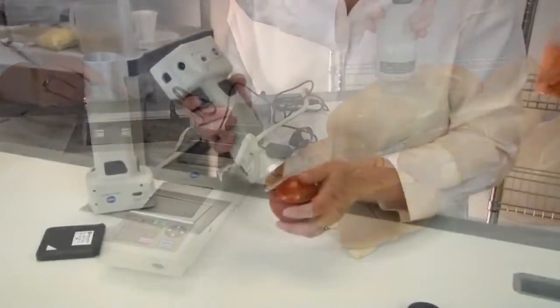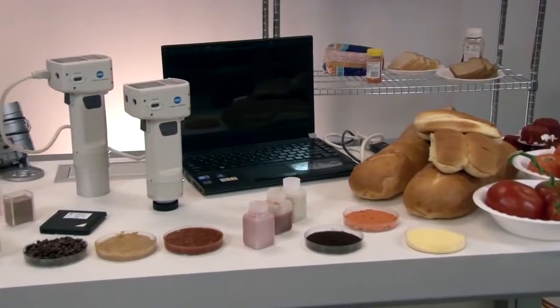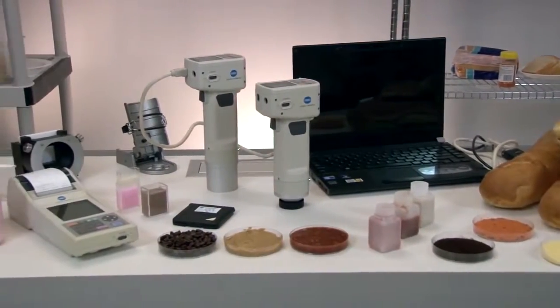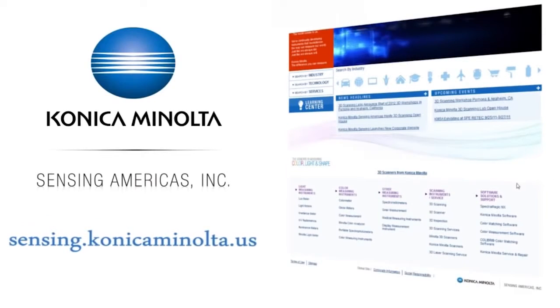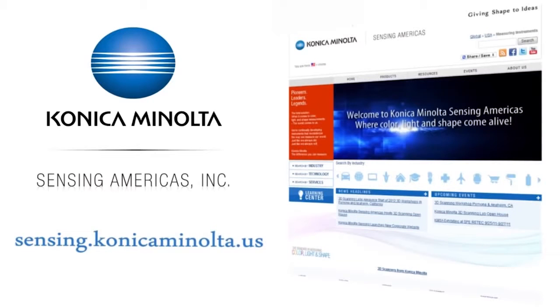Inspect, sort, select, classify, or grade the color of your product anywhere with Konica Minolta's CR400 and CR410 colorimeters. For more information on Konica Minolta Sensing's full line of color measurement solutions, or to schedule a free demonstration with one of our color experts, visit us online at sensing.konicaminolta.us.